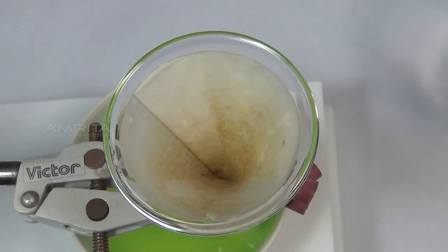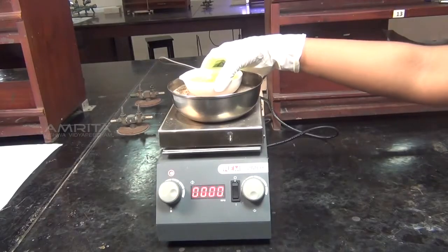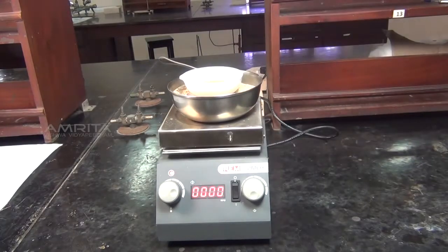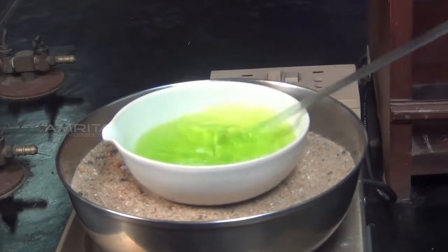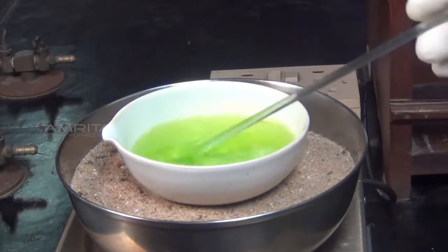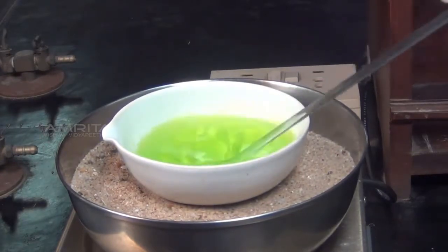After filtration, the insoluble impurities are left behind on the filter paper. Heat the solution in the china dish over the sand bath. To avoid crust formation on the side of the dish, stir the solution continuously with a glass rod.